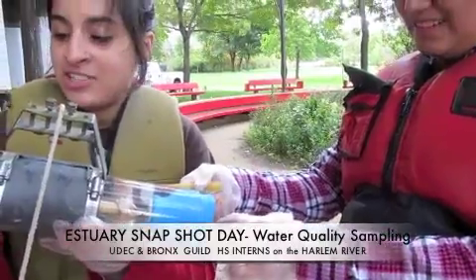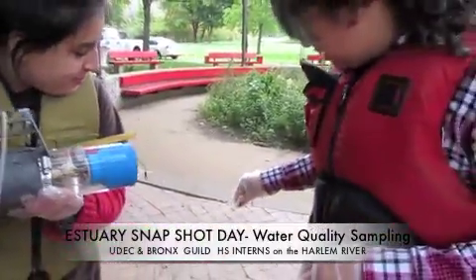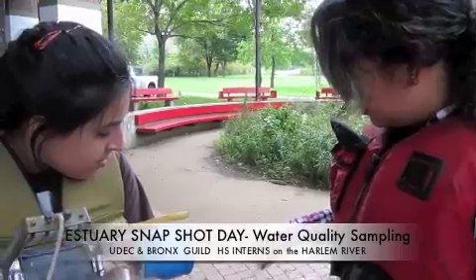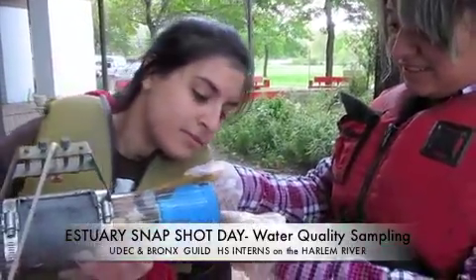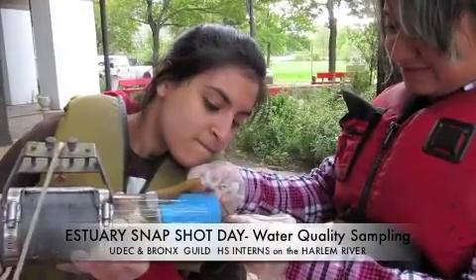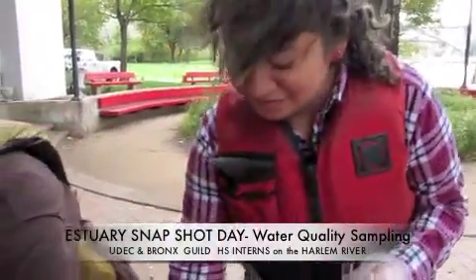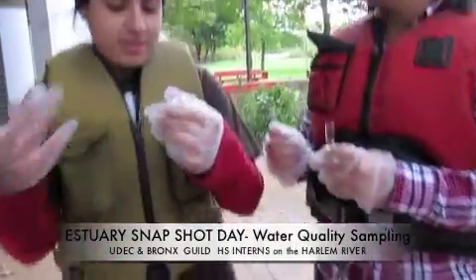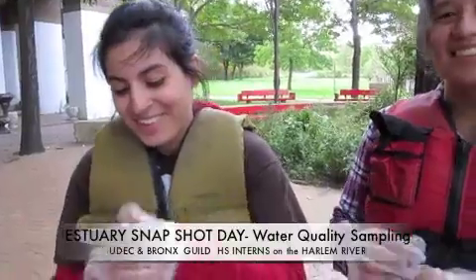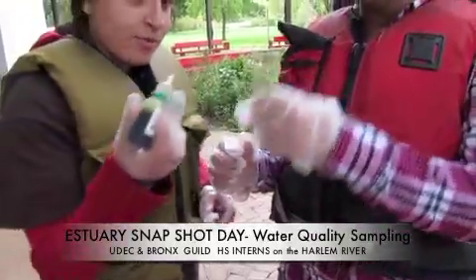We have to squeeze this side gently so a little bit of oxygen can get in and pull the tube up. Now we're gonna empty it out until it goes to the line. That's it. Okay. Now that we've precised it up to the line, we're gonna take this chemical compound, and we're gonna apply 10 drops into this water sample.